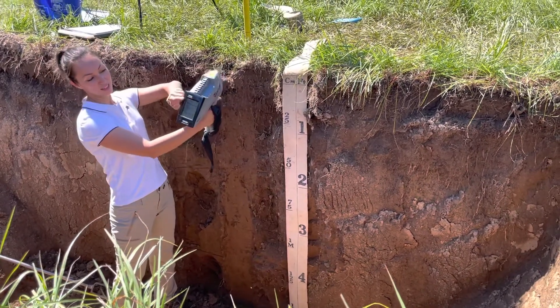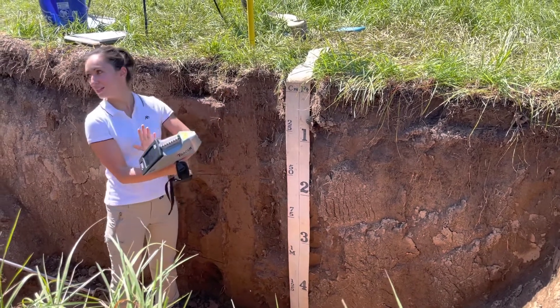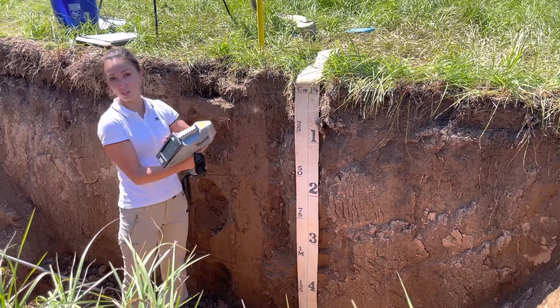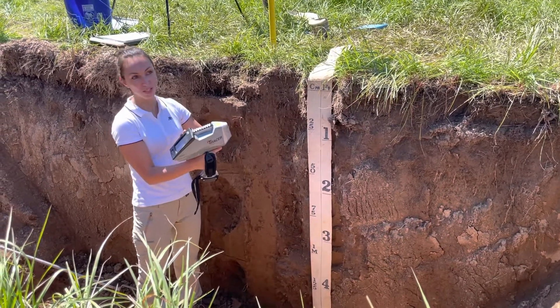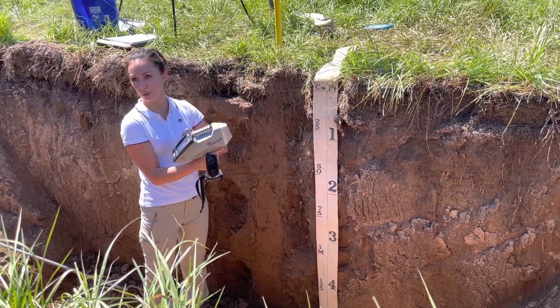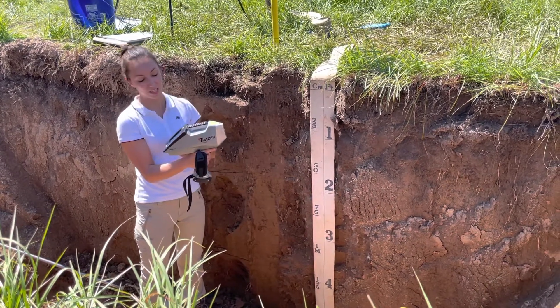There's a screen that directly tells us what concentrations are measured. There are different modes here. I'm going to use a geo-exploration one, but there are also plant matter mode, soil mode, geo-mining, and some other alloy-related modes.